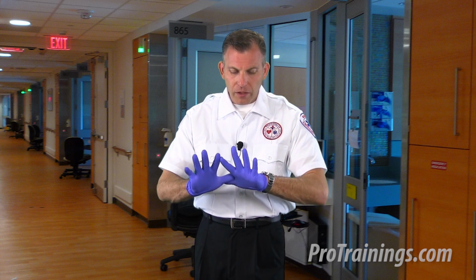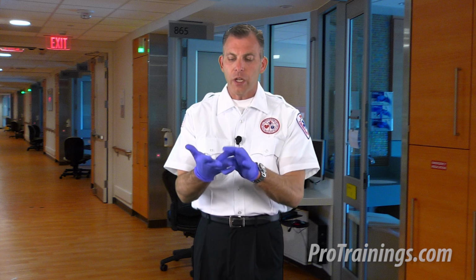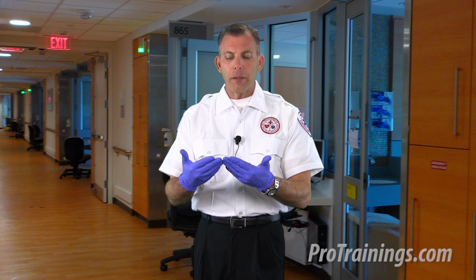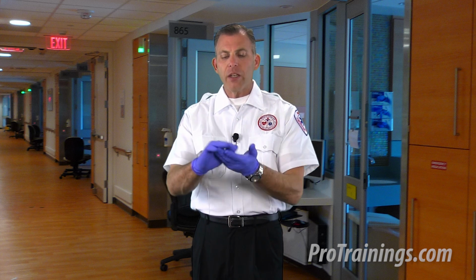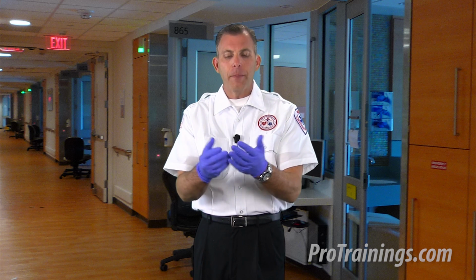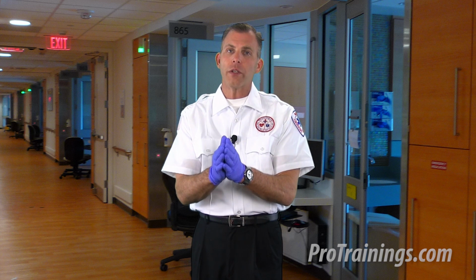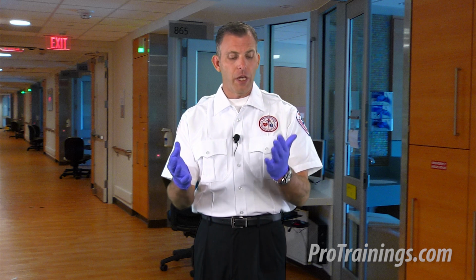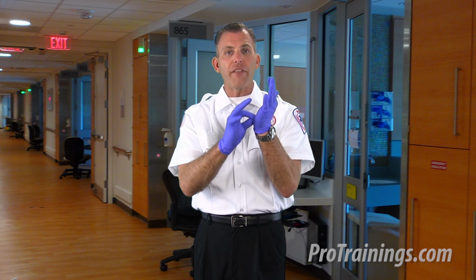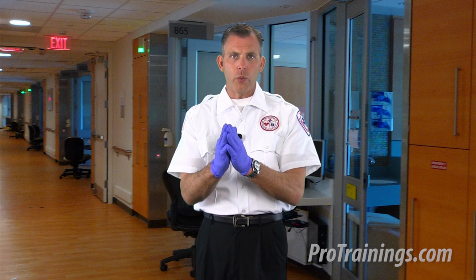So we're just going to put these clean gloves on, normal way. We're going to inspect the gloves to make sure there's no cuts, no holes, nothing obvious that's going to ruin the integrity of this barrier. But then when they're contaminated, now comes the most important part of this next skill, and that's removal of contaminated or potentially contaminated gloves. We're going to follow the glove on glove, skin on skin rule.